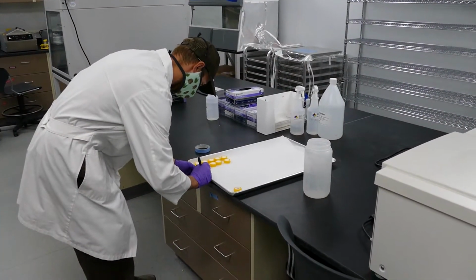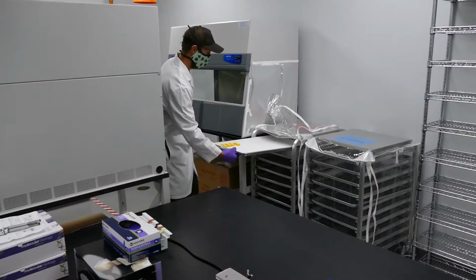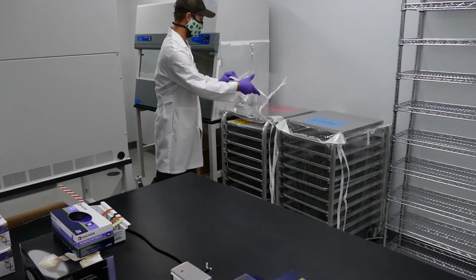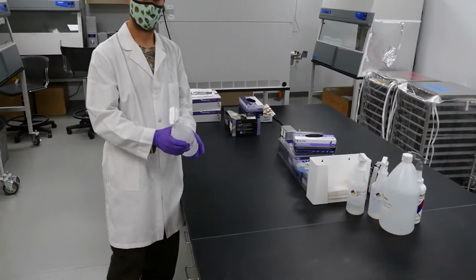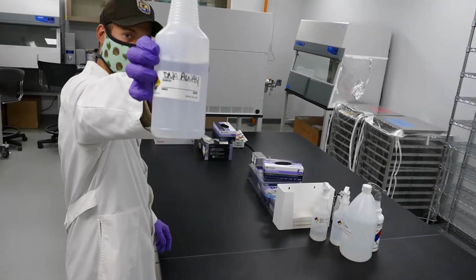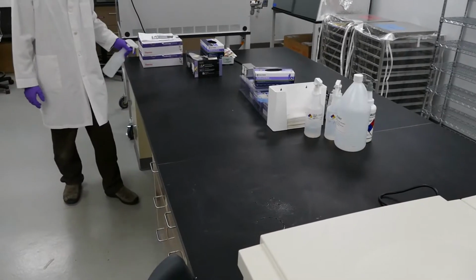While you wait on the samples to dry, you can label the tray with the caps on it to the corresponding samples and place them in the tray rack. You can then clean the workbench area by using liberal amounts of DNA Away and wiping the surface with clean paper towels.